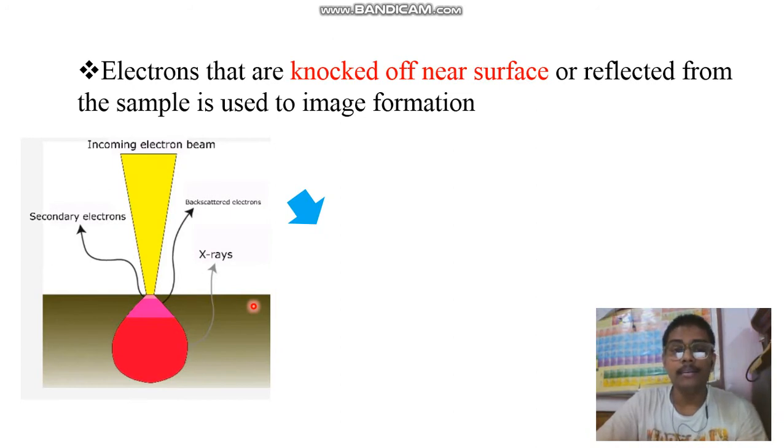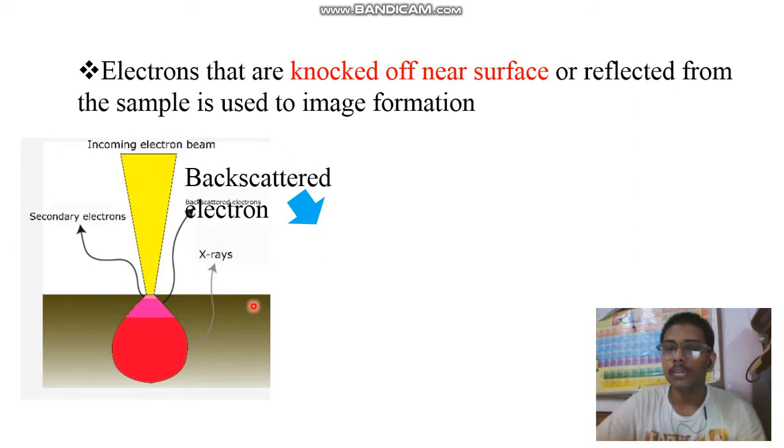So the first electron is called a backscattered electron, and that actually happens by elastic scattering. So what happens in elastic scattering? By definition, when two bodies make an elastic collision, there will be no change of energy, no change of speed, but only the propagation path of the beam will change. So here also the beam will bend, and in this case the beam will bend so much that it returns back towards the observer. So that's why it's called a backscattered electron.